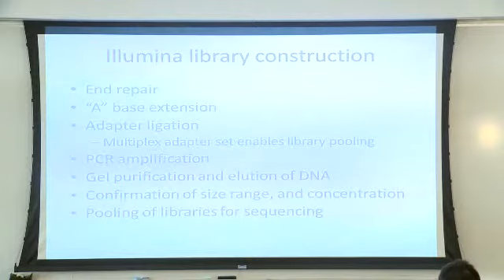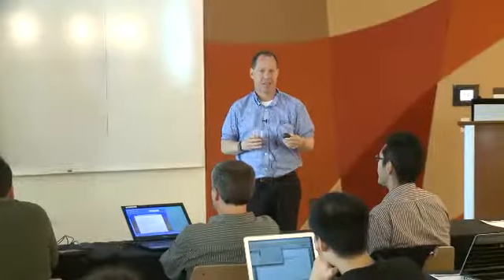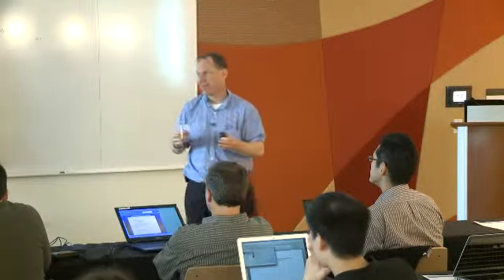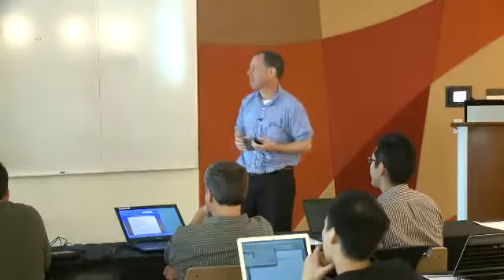So for modifications that occur rarely or in a very punctate fashion, you can saturate your discovery with fewer reads. We just haven't figured out yet how to fine-tune the way we do pooling of libraries to get more reads of certain marks and fewer reads of other marks. But I think it would be a valuable step for us to take just in terms of the economy of the sequencing process.